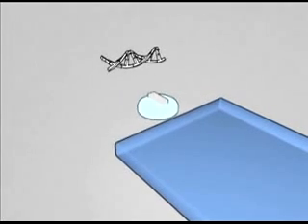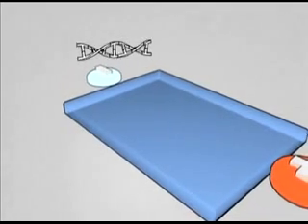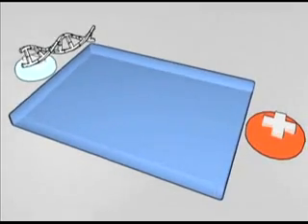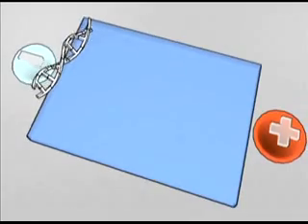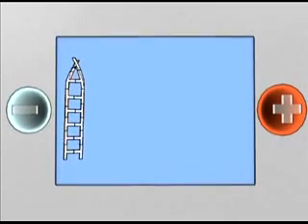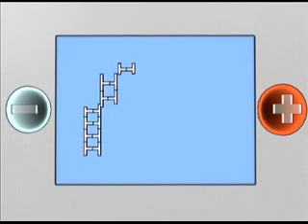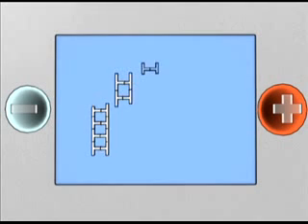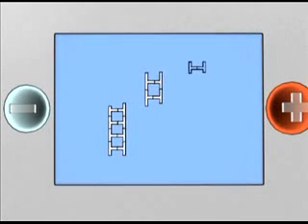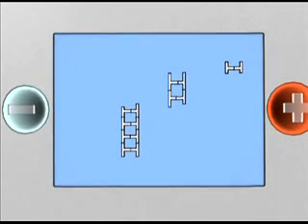Agarose gel electrophoresis is a common method of analyzing samples of plasmid DNA. A tray of agarose gel is prepared with DNA samples placed in wells along one side. DNA molecules have a strong negative charge, so if an electric field is applied to the tray, they will move towards the positive electrode. Agarose gels have microscopic pores, which act as a filter when molecules attempt to move through them. Smaller molecules will move through the gel more quickly than larger molecules. Therefore, if the electric field is applied for a given amount of time, the molecules will arrange themselves by size on the tray. Those closest to the positive electrode are the smallest, and those farthest away are the largest.